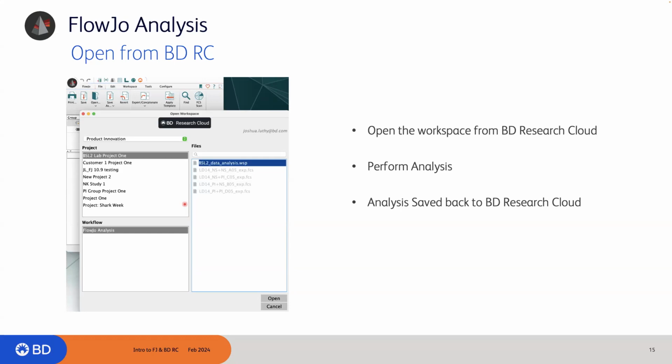Otherwise, if things are in the cloud, the data connection would be reliant on your internet connection speed, and that could lead to poor performance. So those things are downloaded and kept in a local cache folder.